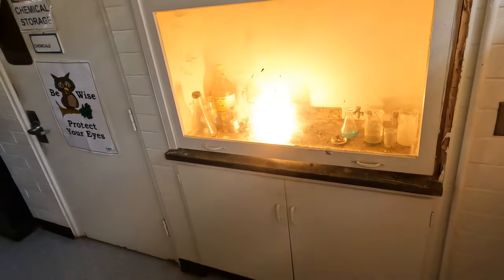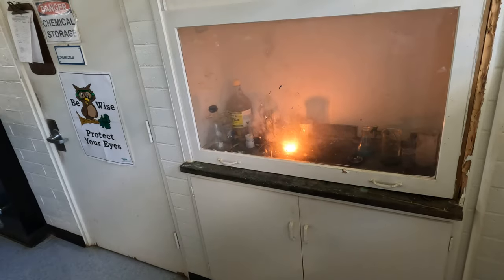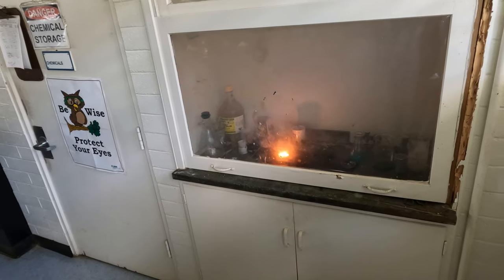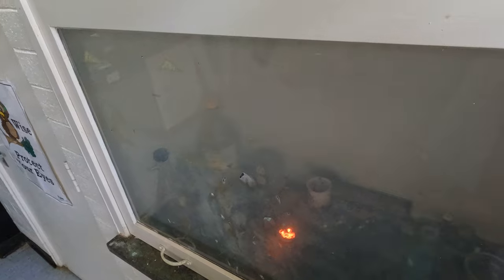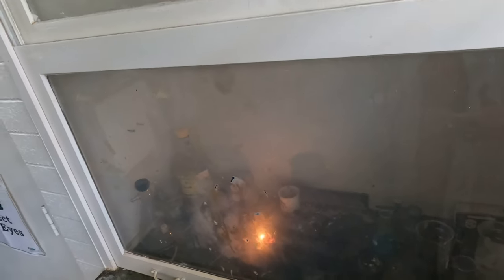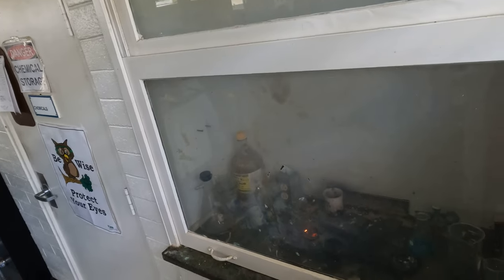So if you'll recall, the last one kind of like exploded all at once. And this one didn't. And now my eyes are burning. So why didn't it — and now it's still glowing, it's kind of cool. So why did the last one blow up really fast and this one kind of didn't? Why? What's going on?